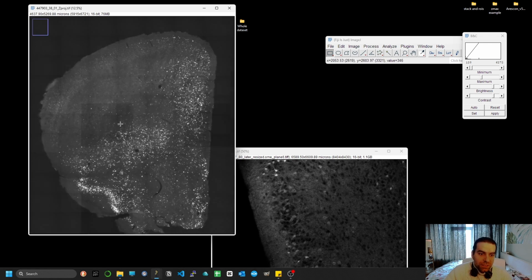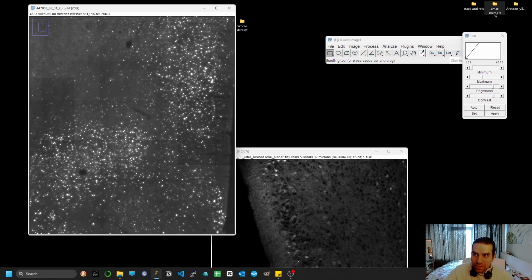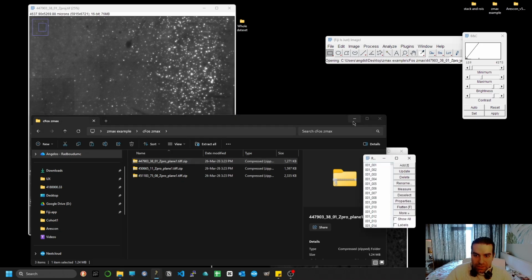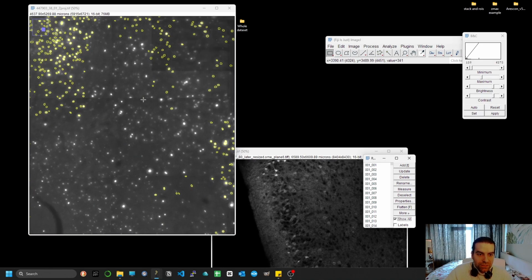And although it's really nice for visualization purposes, it hasn't worked nicely for me when I was using Cellpose, for instance, to detect cells. I can show you an example. So if I go here and I find some inferences taken from Cellpose, you can see that many of my objects are actually missing.